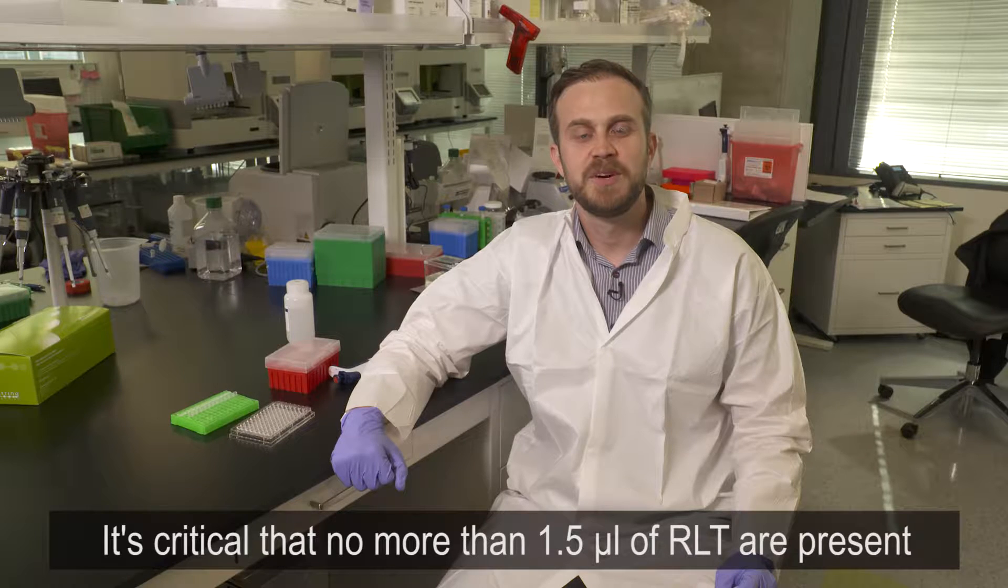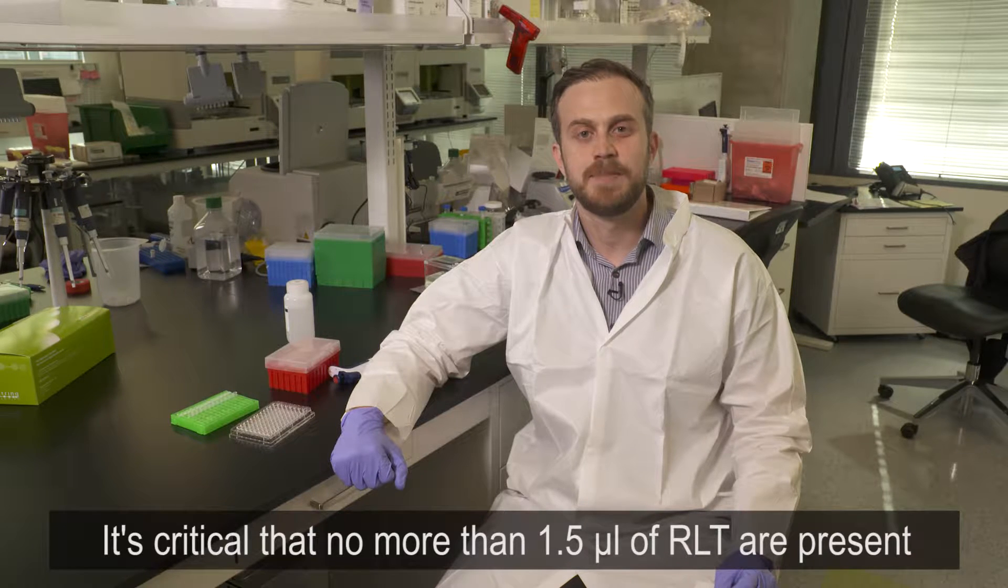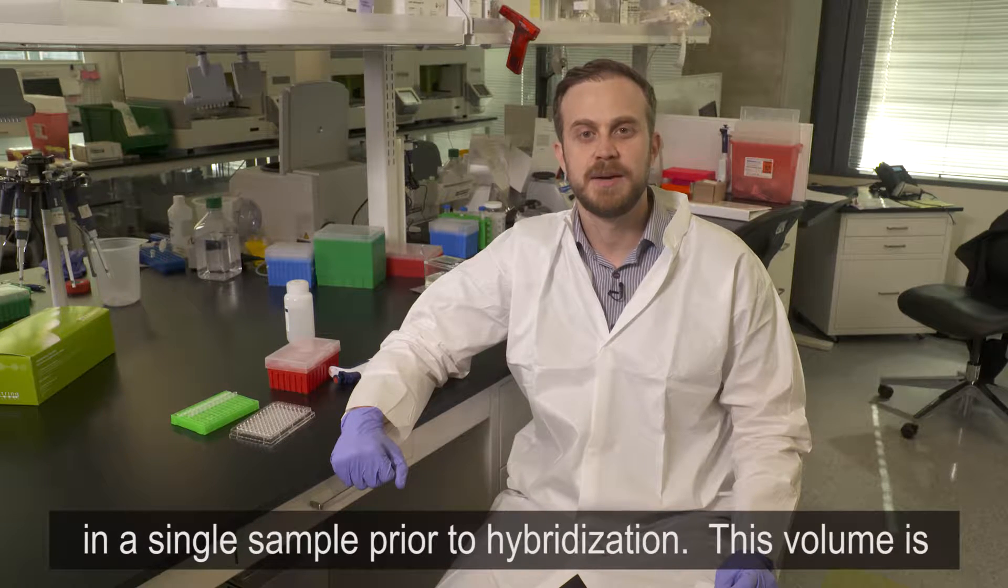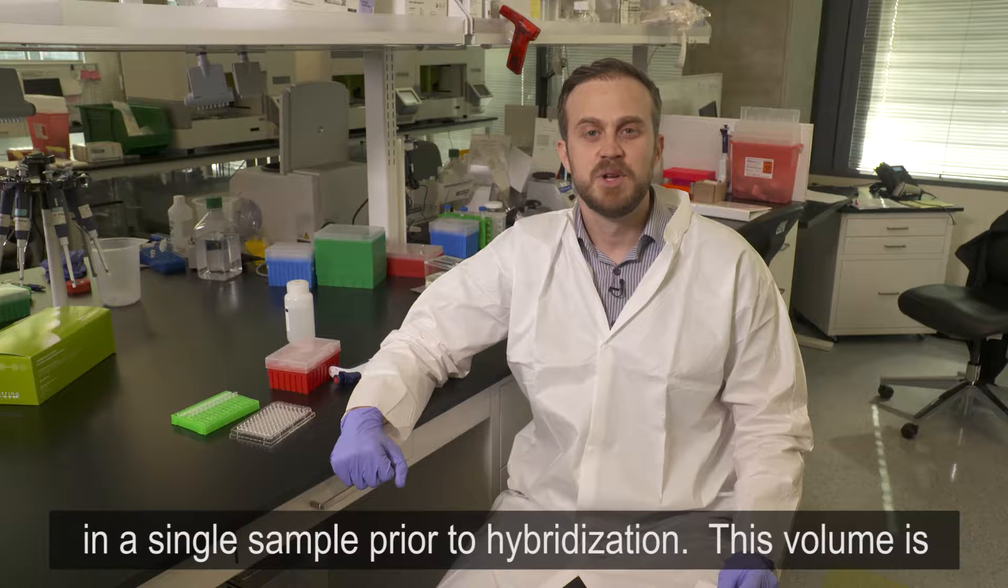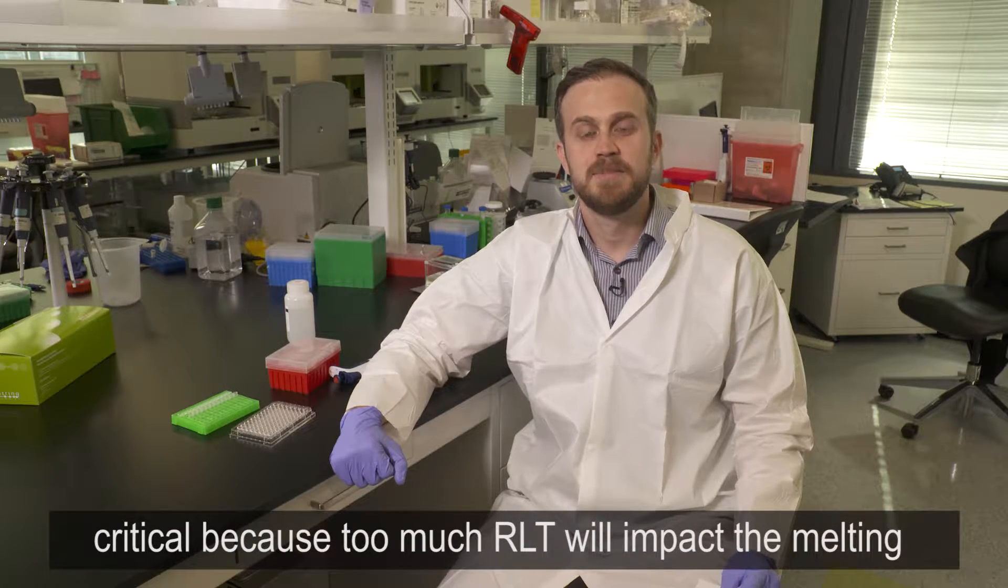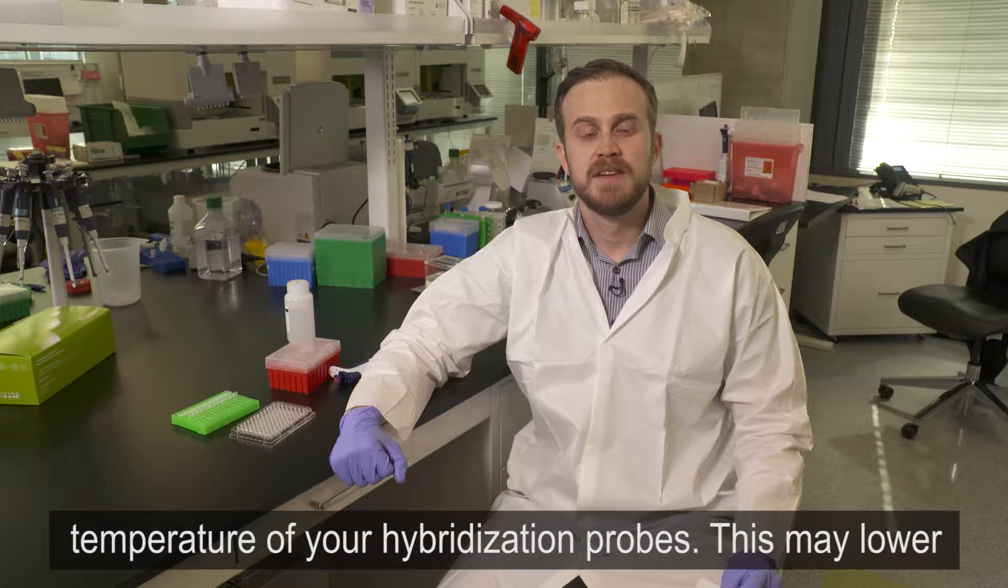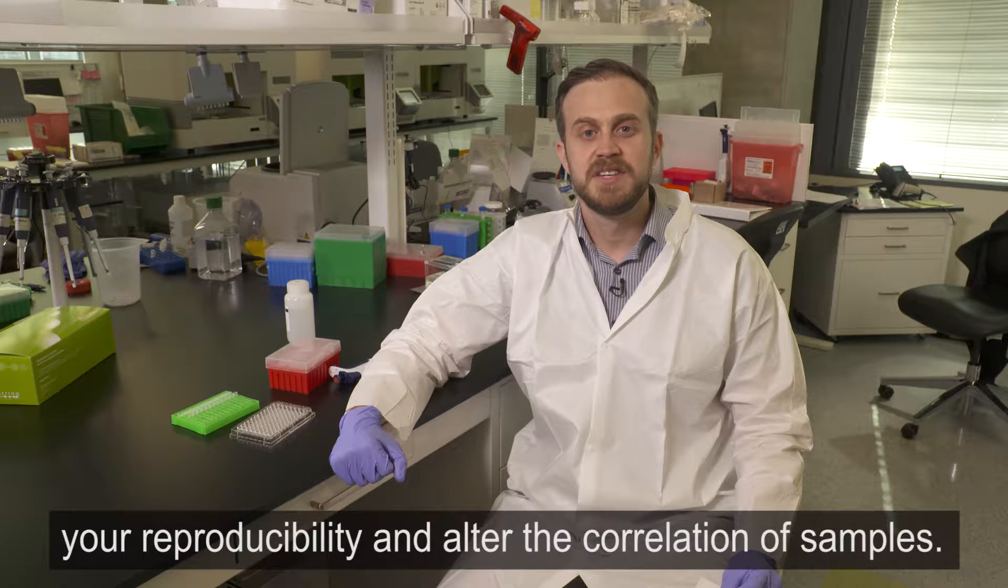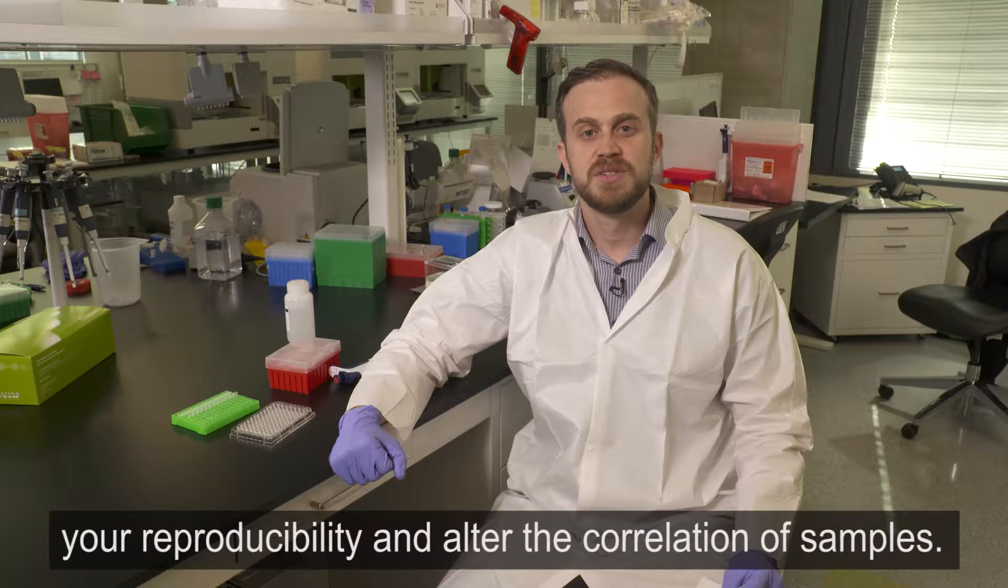It's critical that no more than 1.5 microliters RLT are present in a single sample prior to hybridization. This volume is critical because too much RLT will impact the melting temperature of your hybridization probes. This may lower reproducibility and alter the correlation of samples.